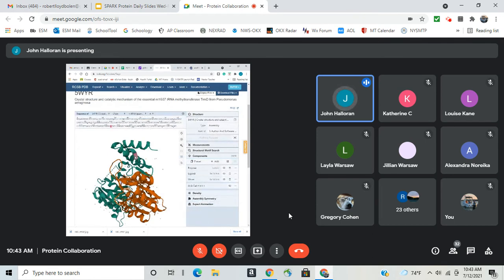You can scroll over the structure, and I don't know if you can see this at home, but you can mouse over it. Yep, you can see it. Okay, it changes to a purple color. Yeah, this is the one I'm highlighting, and as I highlight it, it actually tells me which amino acid. I can do it the other way too. If I want to figure out where the 32nd amino acid is, it's a G.